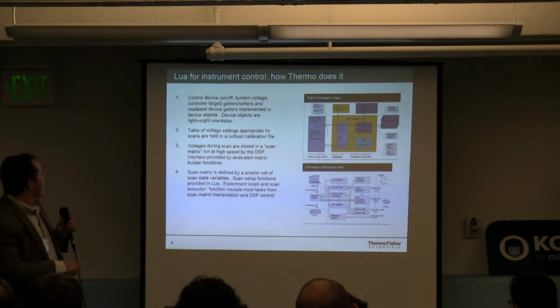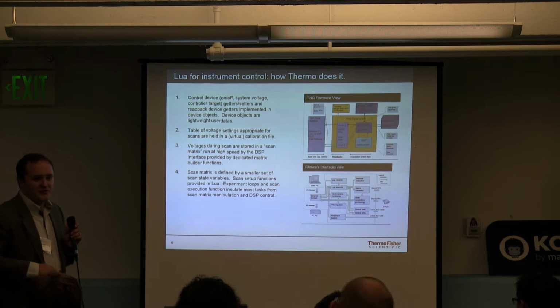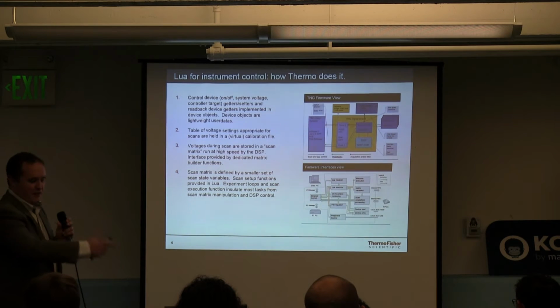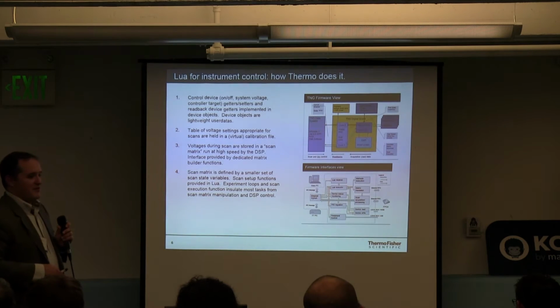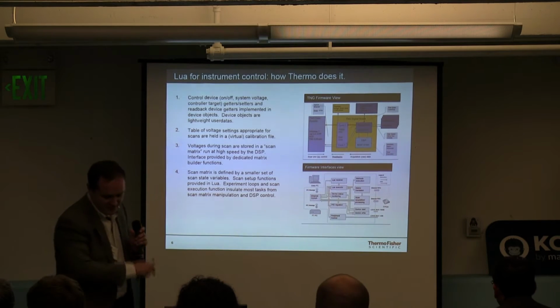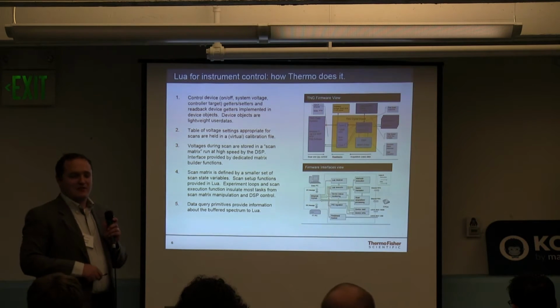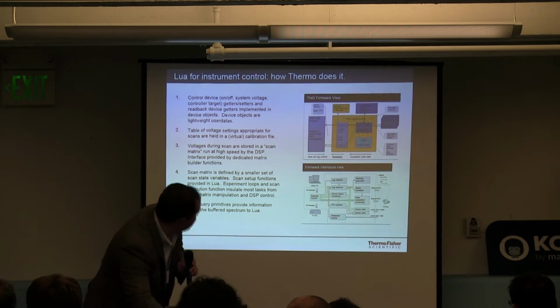Lua does not. This is defined by a smaller set of scan state variables. So really what we expose to the everyday user is a bunch of setters saying, okay, take full scans, take product scans, take this parameters. So people can, in effect, just switch the instrument between different modes with a Lua command. We'll see that in the next few slides. And finally, a data query function saying, pull up what was that spectrum, how much would it have at a particular mass, then pull back to the Lua for mathematical analysis.